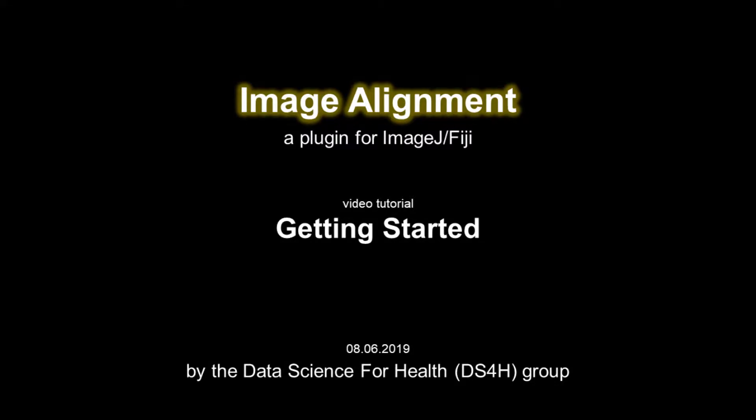Welcome! This is the first video tutorial about the Data Science for Health Group Image Alignment Tool, a plugin for ImageJ and Fiji.